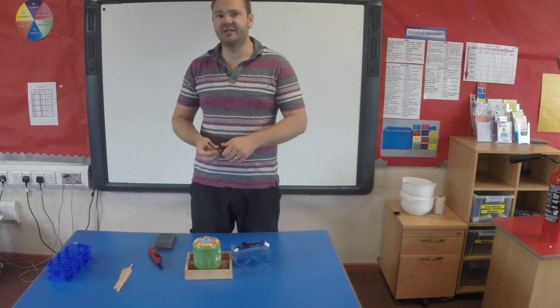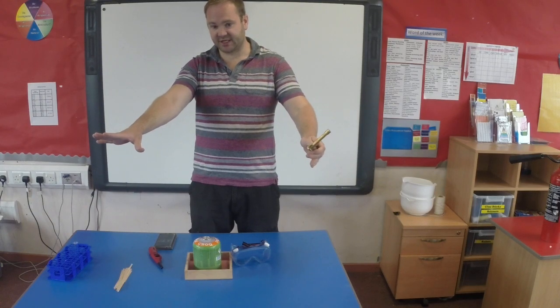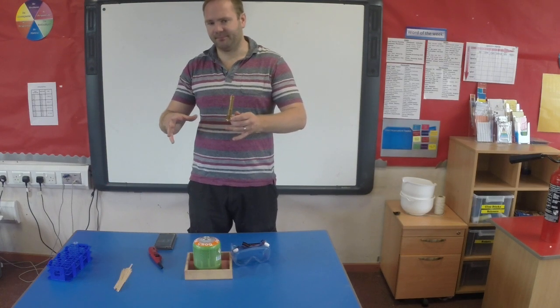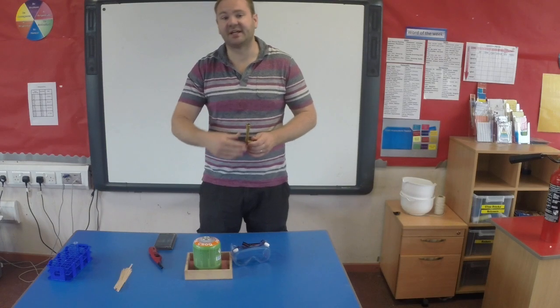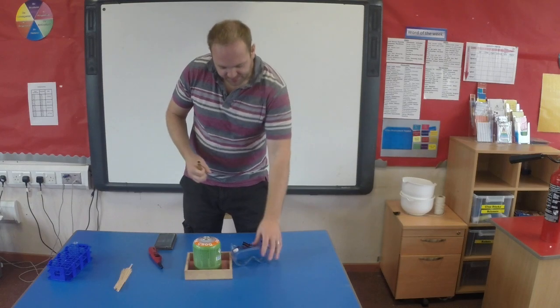And this is something that you can easily do in a classroom perfectly safely, as long as the kids are sitting down and it's just an observational lesson of you doing a particular experiment. I wouldn't encourage anyone to be doing this with their class actually getting to participate in any of this. So, in order to do this safely, first of all you're going to need safety goggles.